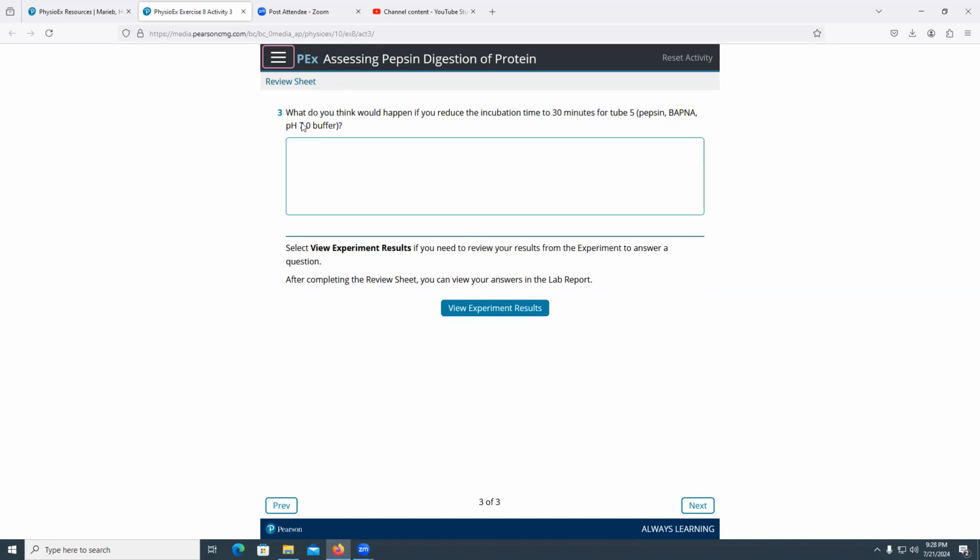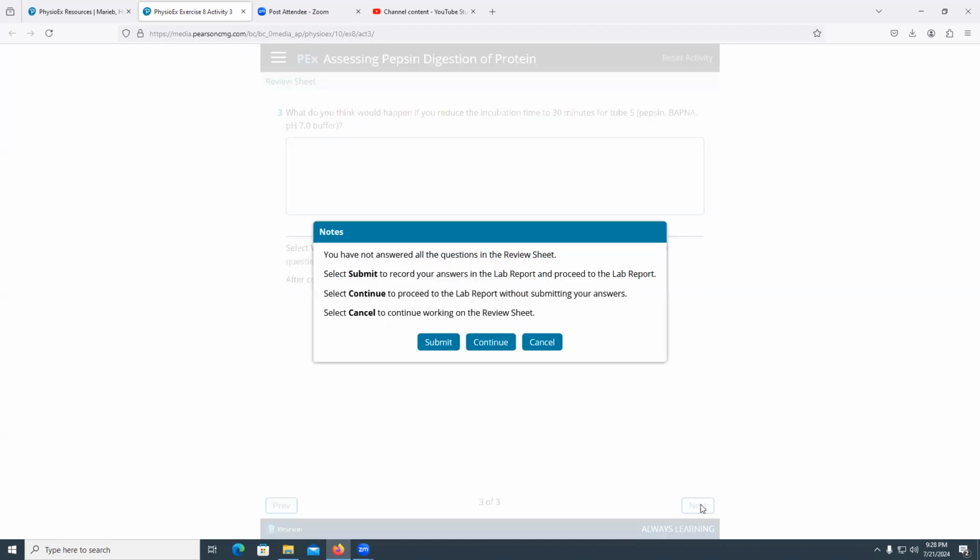The optimal pH is 2. Now you went up to 7, which is about 5 units away from the optimal pH. And now you're going to reduce the time even more, so the optical density is going to be even less, and you're going to have less product and less reaction going to completion.